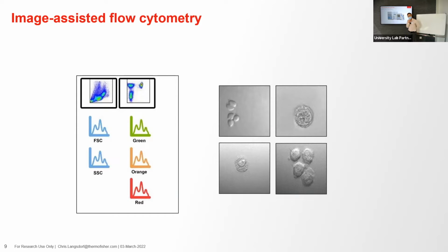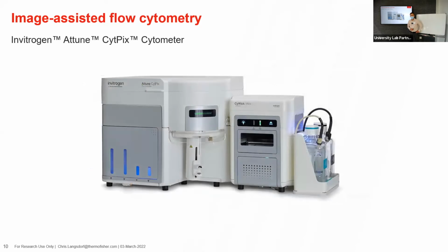You think this would be interesting for your work? Oh yeah, I think it would be nice. Well, the other stuff is fine. It's just the camera. I think it's more for things where you're looking for a small population and you want to observe. But overall, I think for most of the things you do in flow, what we have is nice. And it's the kind of thing where if I have a confusing result on the regular tune, I'll go walk across the hall to this instrument and see what's going on.